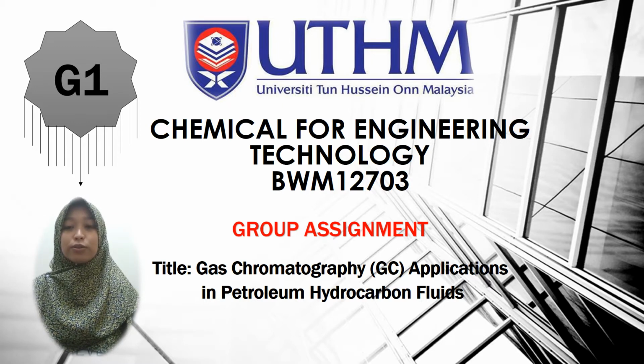So we are given the task to find out about gas chromatography. From our discussion, we have decided to choose gas chromatography applications in petroleum hydrocarbon fluids.